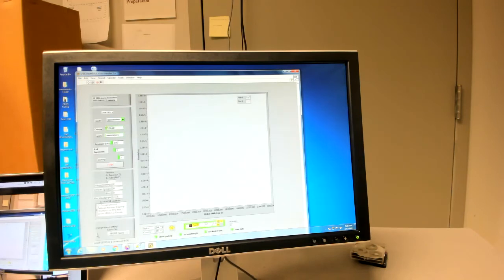Okay, here's the exposure time. Let's set it to 0.1 seconds. We're going to do one exposure, but we could set this to a larger number to average over spectra if we wanted. Okay, and then we'll leave the grating set at 1. And now we're ready to go.